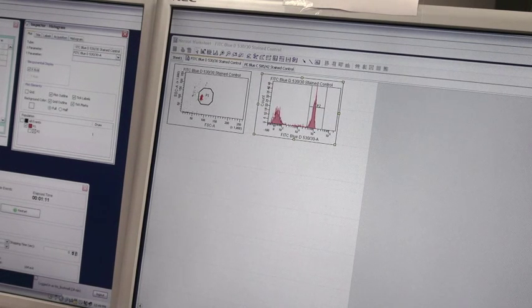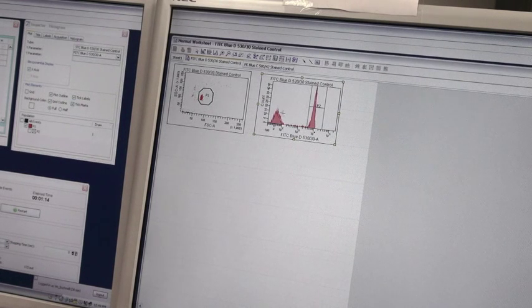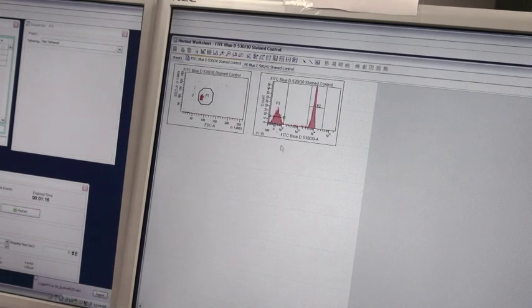To identify the negatives in this tube, we are going to use a histogram gating tool and create a P3 gate, shown here.